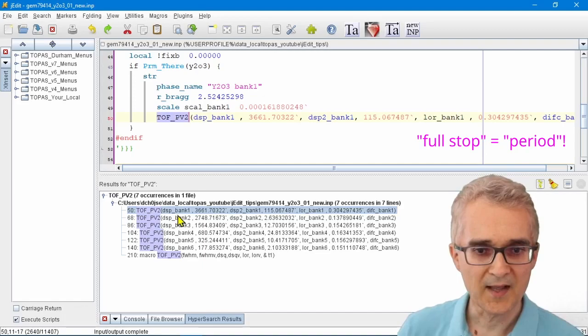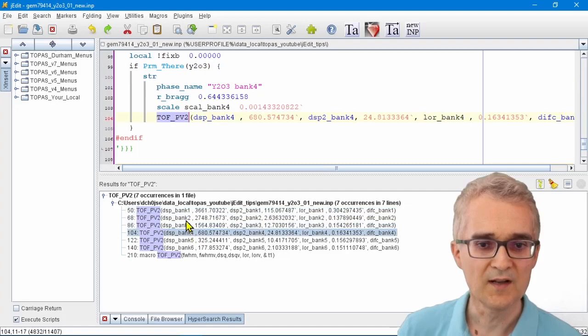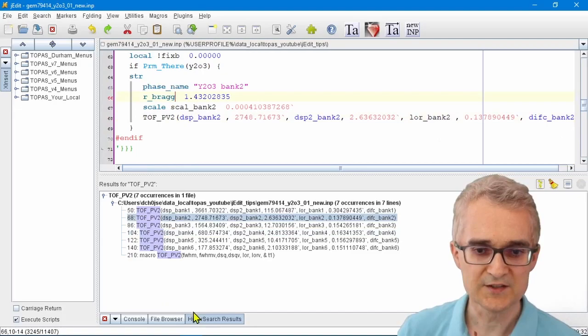That lists at the bottom all the places in the file where I've got this particular line entered. I can see the peak shape for bank one, bank two, bank three, bank four. If you want to look at one of them, just double click on it and you jump to that part of your input file. Alt+period is a really quick way of working.